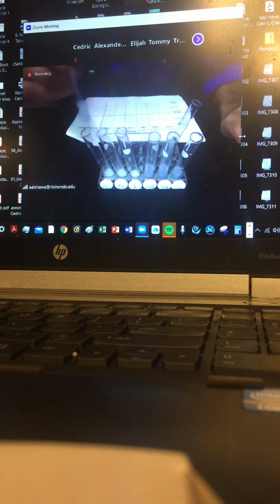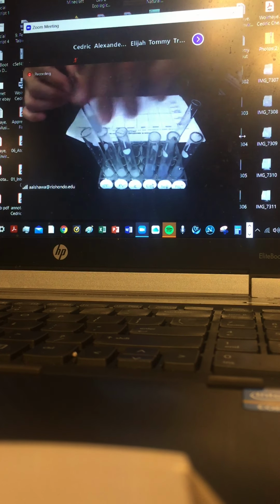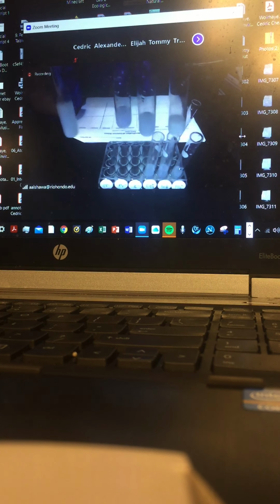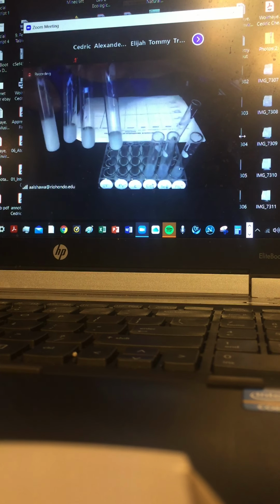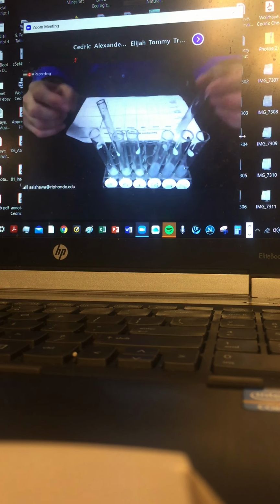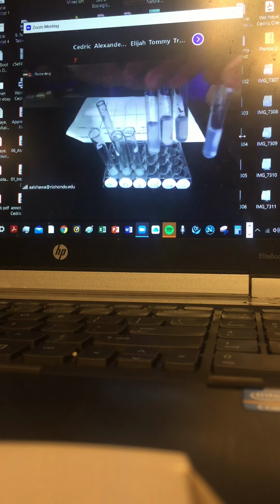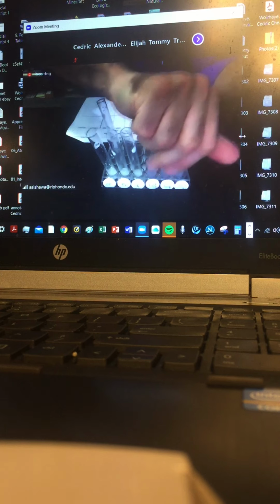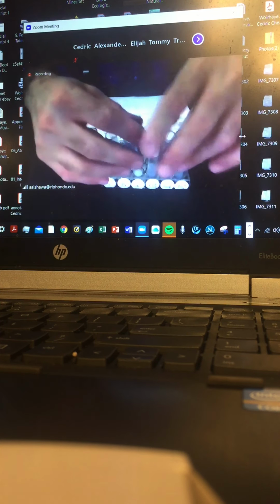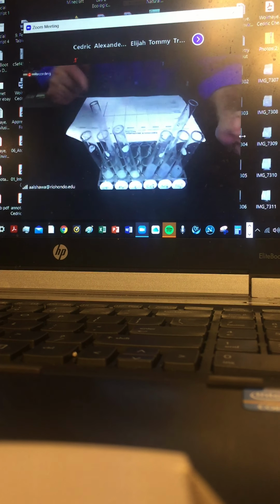So unknown 1, with the silver nitrate test, exposed to the halide, produces a cloudy solution, similar to those first 3 test tubes. So that is a similar outcome, as obvious. But the second unknown, I guess, resembles much the same those 3 tested. So this is the first quest of figuring out the unknown. So record all these results in here.